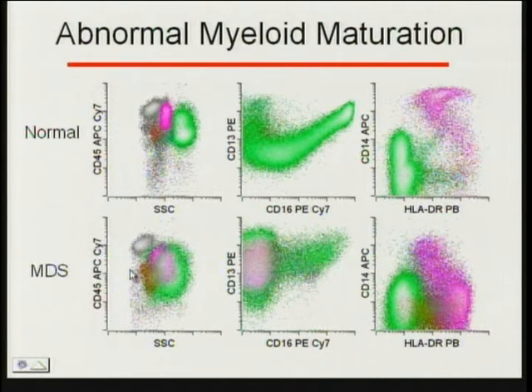In this patient with myelodysplasia, one sees a marked abnormality in the CD45 side scatter pattern, with a loss of side scatter variably on the maturing myeloid population, indicating hypogranularity, an expansion of monocytes, indicating an immature monocytosis, and also in red, although it's difficult to see, an expansion of early progenitors, indicating an increased number of blasts. Looking at myeloid maturation, the pattern of maturation is clearly abnormal and different from that seen normally. And looking at monocytic maturation, similarly, there's a marked expansion of immature monocytic cells with very poor maturational progression.